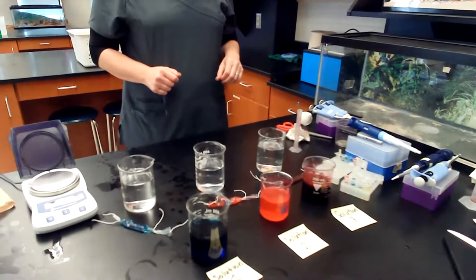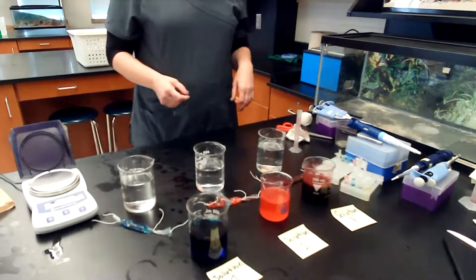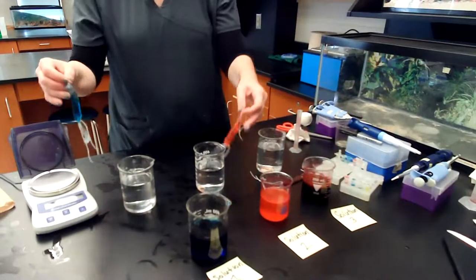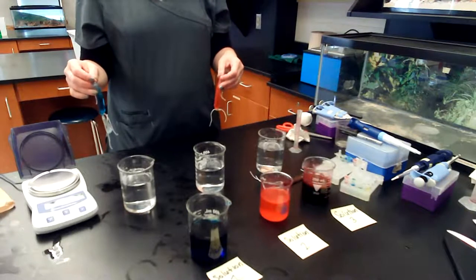All right. So now what we'll do is put each one of those dialysis tubing filled with each solution into the distilled water, where they will sit for how long? Did we say 20 minutes? And then at the end of 20 minutes, we will record the new weights.